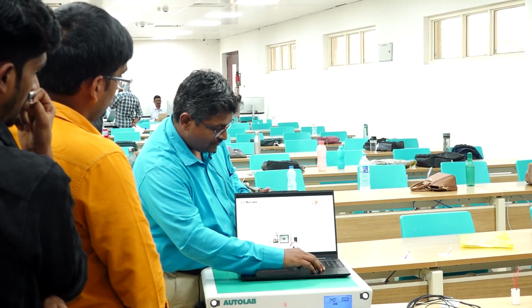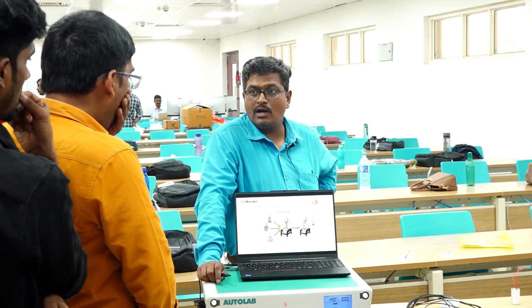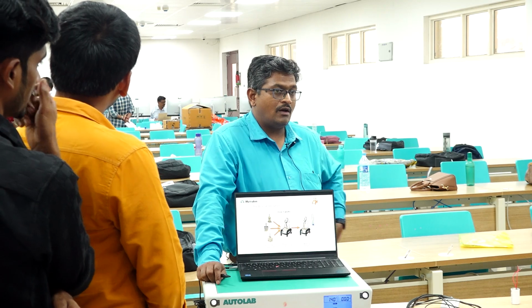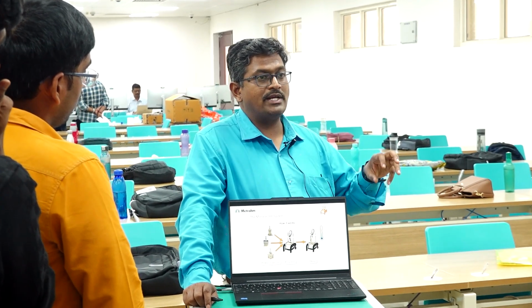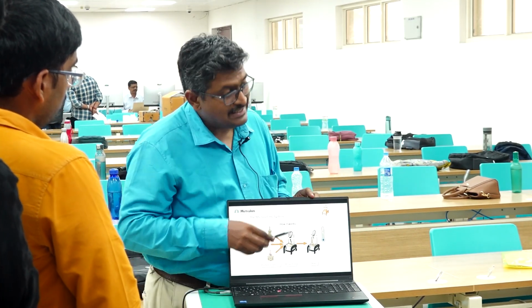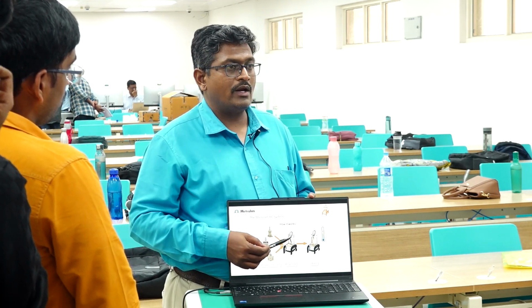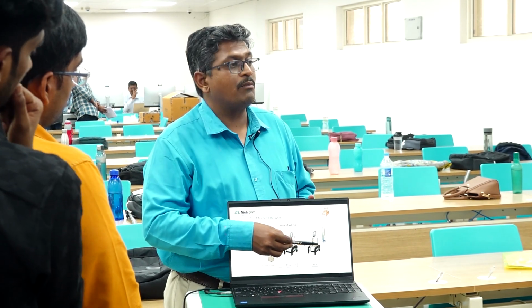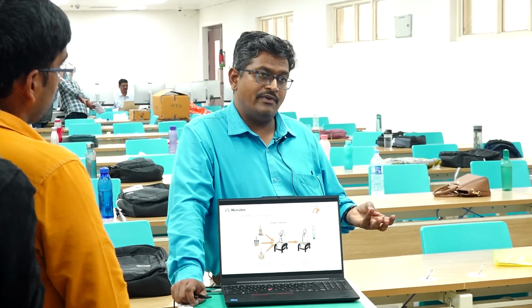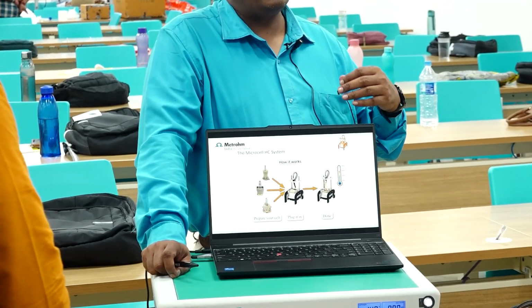Second is, when you are doing some lithium based battery developmental work, lithium you cannot work with at room temperature or outside. It is dangerous, it is explosive in nature. So people do all their preparation or fabrication work in a glove box. You can take this cell inside the glove box, add your material and close the cell. Then you can take the cell out, connect it to our equipment, and vary the temperature, and you can monitor conductivity and impedance at various temperatures, so that you can evaluate the battery material property at different temperatures.